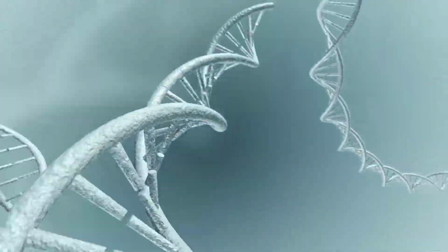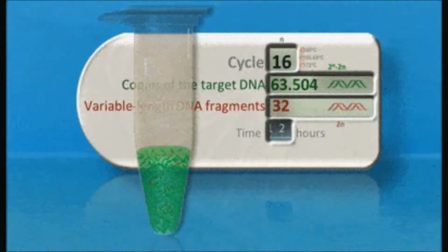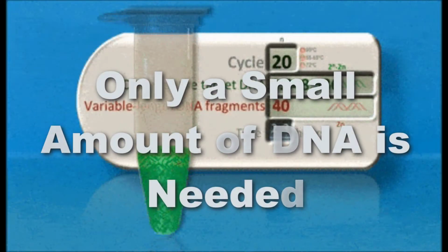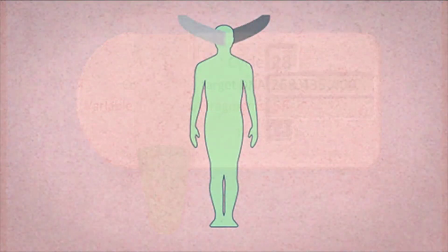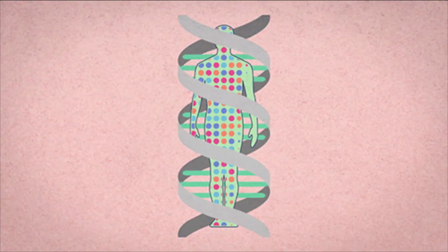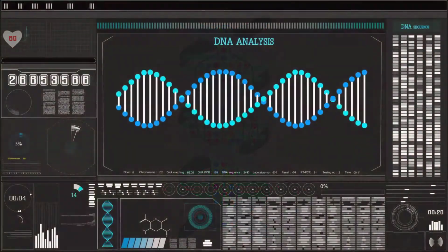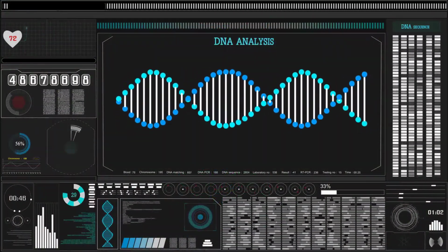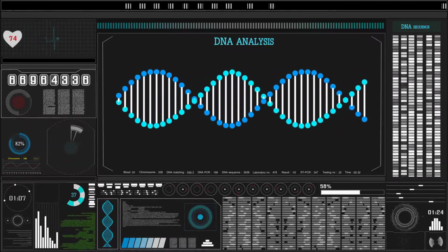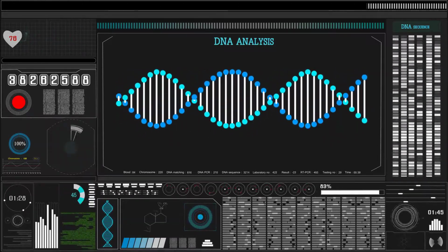In its early days, DNA analysis required an evidence sample of at least the size of a dime. Today's techniques can amplify the DNA using PCR, or polymerase chain reaction, which makes millions of copies from the tiniest amounts of evidence. This approach is also helpful for analyzing poor quality DNA and evidence samples collected from dirty crime scenes or in very old samples.